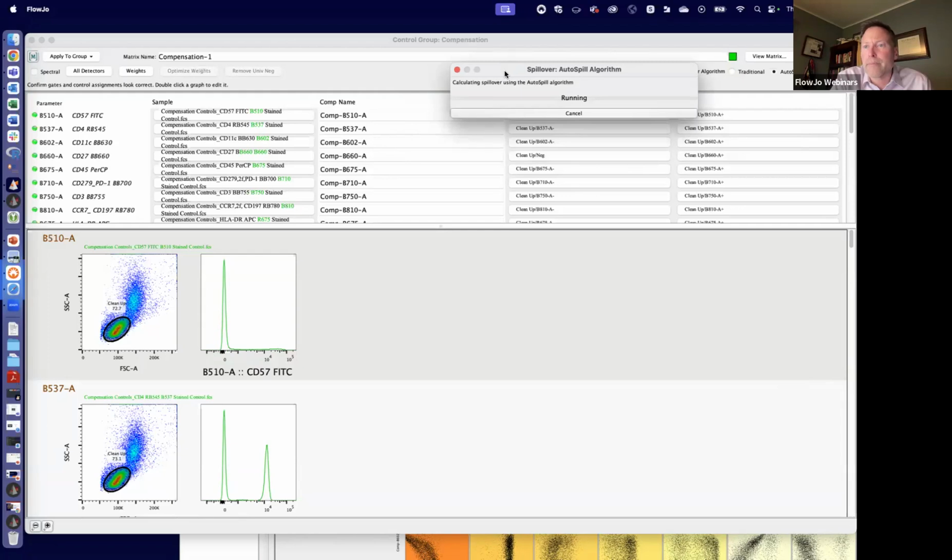All right. How are we doing? 7:58. So I am running behind, and this is taking a little while. I wanted to very much show you V11.